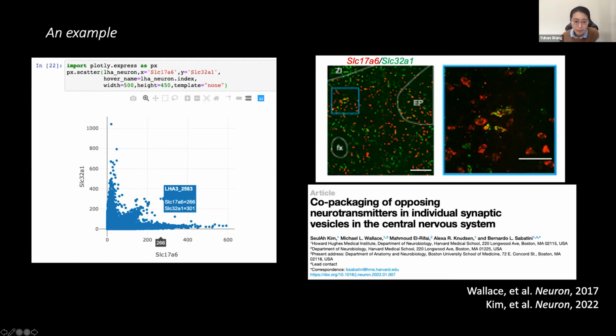But yeah, I guess you can also imagine that instead of plotting a scatter plot with two gene expressions, we can also replace this with a PCA or UMAP that displays all the cells, the molecular cell types. And then the same goes that you can select subsets of the population and display them, and see whether they are spatially enriched or evenly distributed across the tissue volume. So I think it would be quite interesting to have a Napari-based plugin for that.